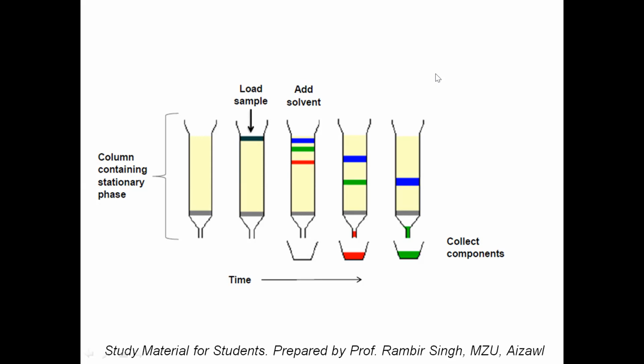Very good. Now, when the interaction of the mobile phase with the stationary phase increases, what will happen to the interaction of the solute with the stationary phase? Will there be some change or not? There might be some change, because the mobile phase is interacting. So what will be that change? It will not get adsorbed that quickly or that efficiently.